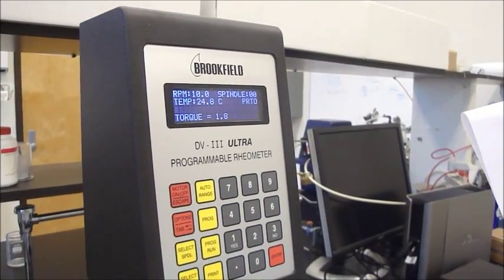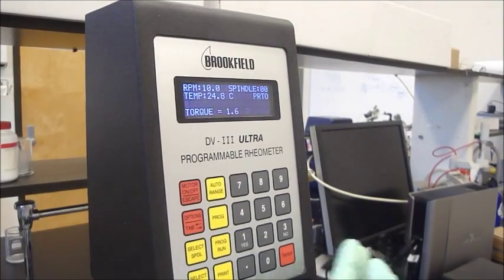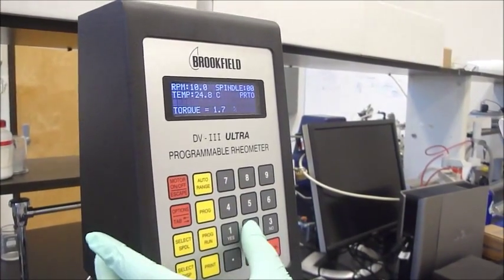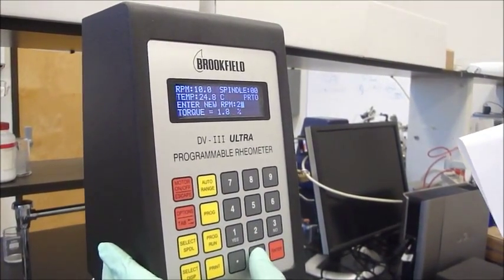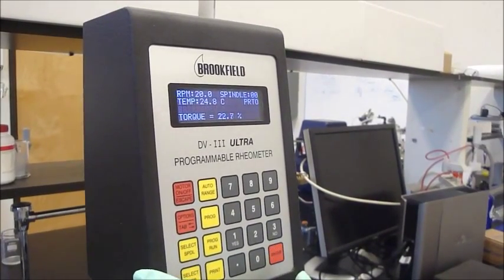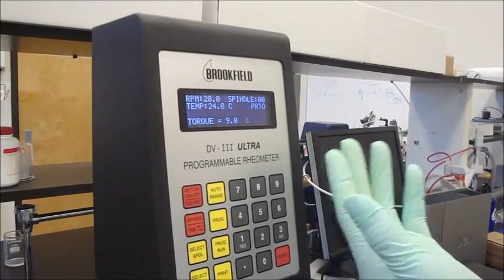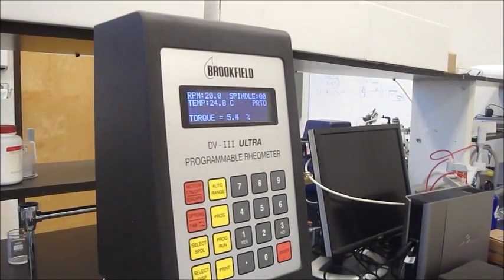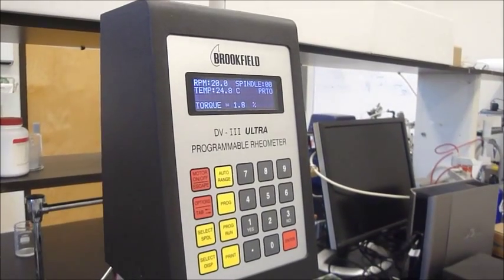And after this data are recorded, you can go to a higher RPM like 20 and enter. Then after the reading is stable again, you can record all this data.